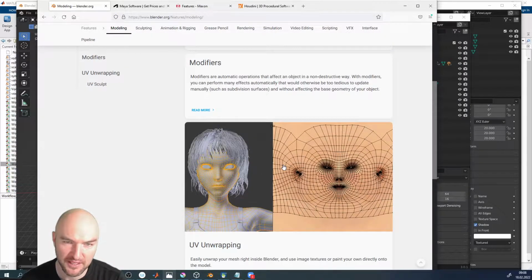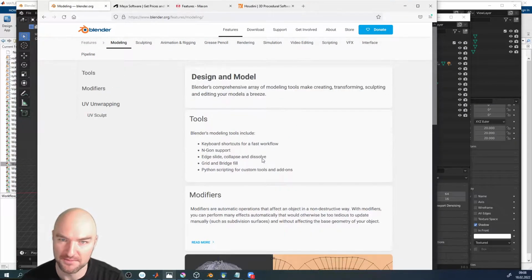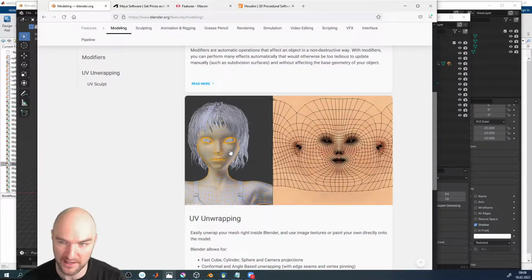And the reason for that is that usually light scattering happens at surfaces. That's not always true. The reason why living things look living is because the light scattering doesn't always happen on the surface. It goes a little bit deeper than the surface. It's called subsurface scattering. But essentially, that's where the light scattering happens. And so, if you want to outline objects in 3D, you model their interfaces, and that's great for us because interface modeling is what we want to do as well.